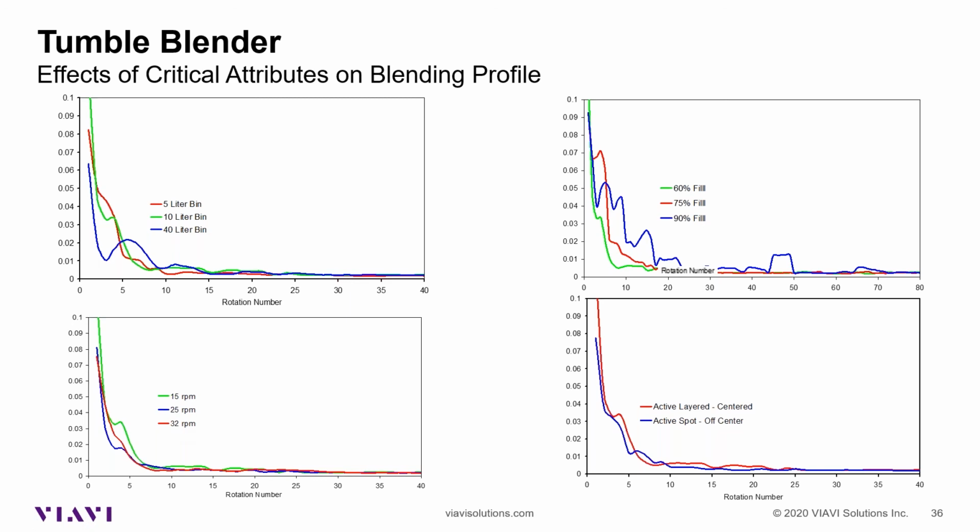Especially in the beginning, I thought that if we were rotating the blender faster, the results would be better. Actually, no, the results are better if you find the right speed to blend your product. And the same applies to the way that you are loading the ingredients inside.